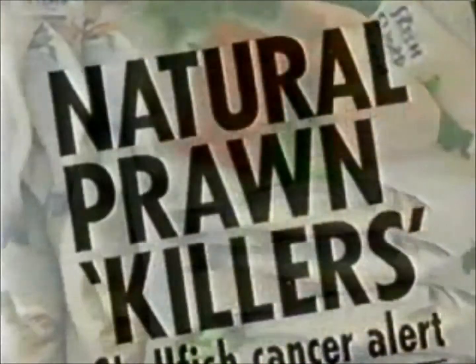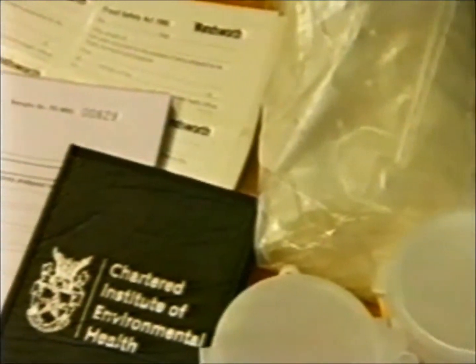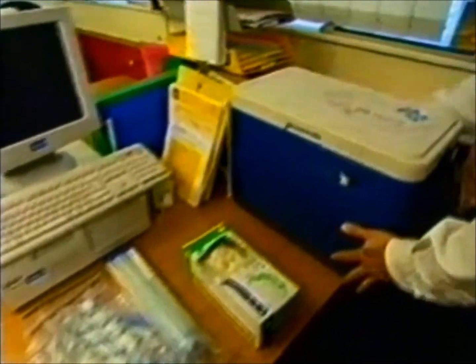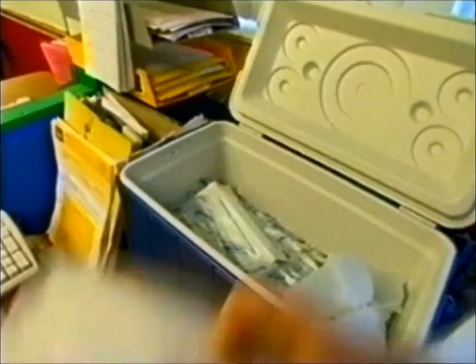The key to sampling successfully is preparation and being systematic. The most important thing you can do is make sure that you've prepared thoroughly before you leave. By preparation, I mean making sure, at a basic level, that you have all the correct tools and forms and labels that you require for sampling, that you've got a cool box with the correct cooling packs in it, your data logger, your thermometer and your white suit.